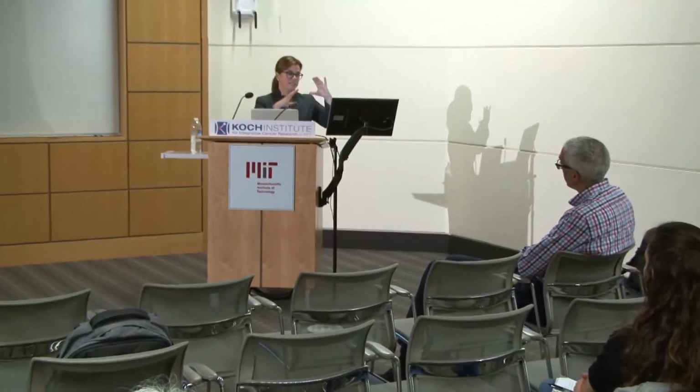So we could. Right now I just showed some relative intensity, assuming that they would have similar desorption ionization efficiency. It seems like there's a 10-fold ratio between the two. But in some other work that we're doing intraoperatively where we follow metabolites, we use isotopically labeled metabolites, and we've done a study where we can mix this into the spray of solvent and matrix that we put on the tissue, so we can do a calibration with an internal standard using an isotopically labeled metabolite. We don't have it, and we're not there yet. We haven't wondered about that, but yes, we can.